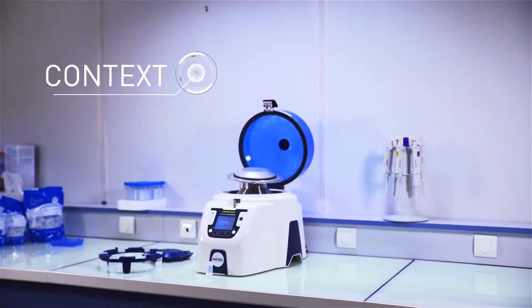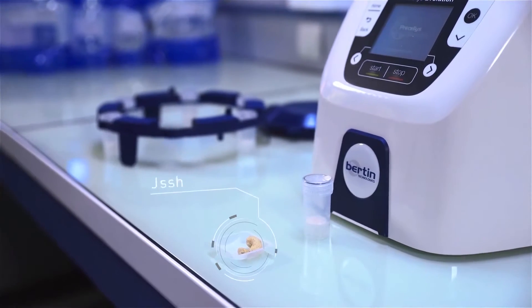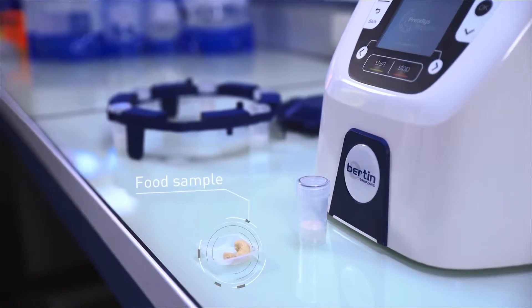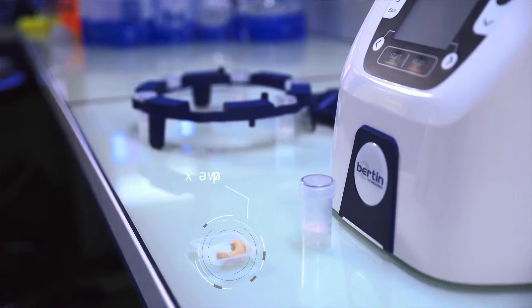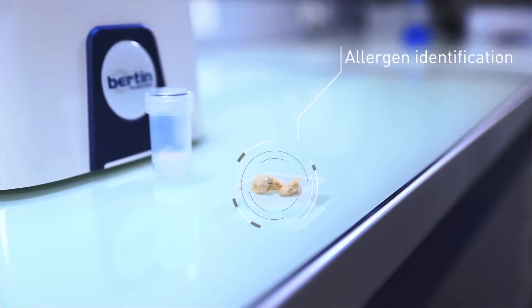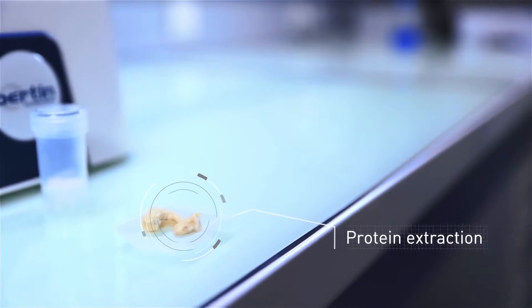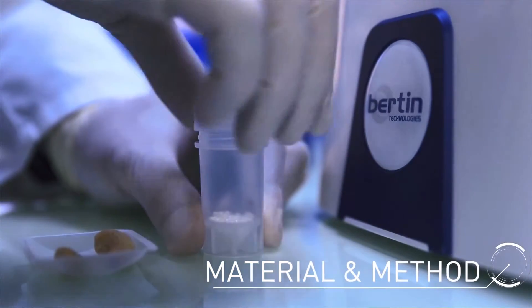This study targets the identification of allergens recognized by the IgE antibodies from patients with allergies. Genklus SAS wanted to enhance the homogenization procedure of samples that are difficult to grind, in order to obtain high protein concentration after the homogenization step.